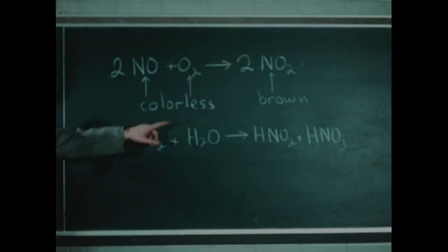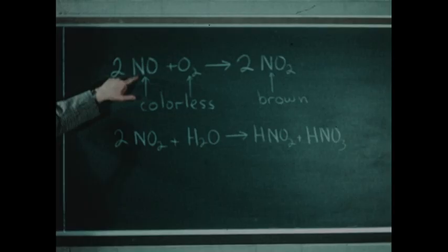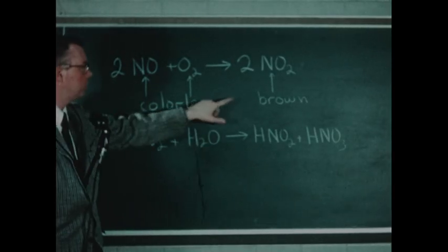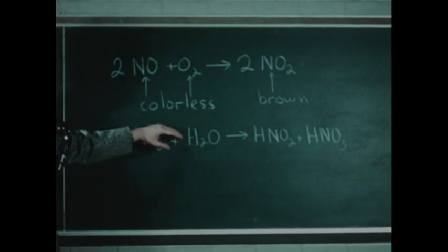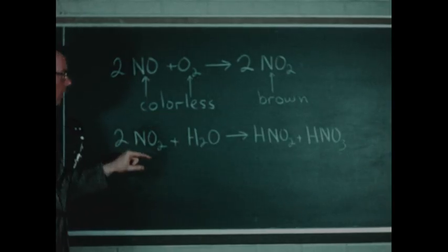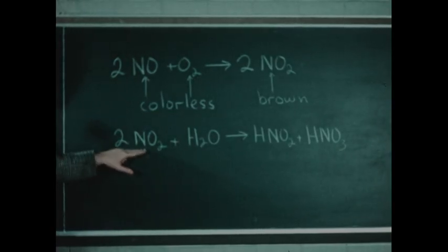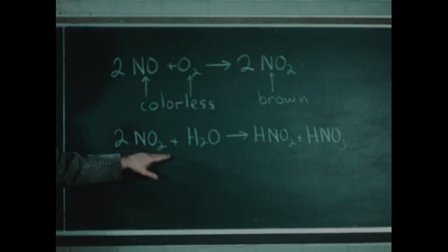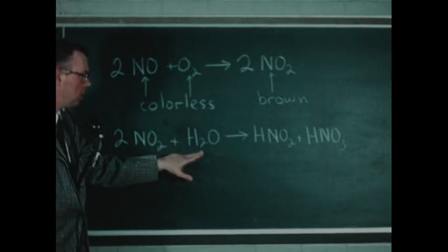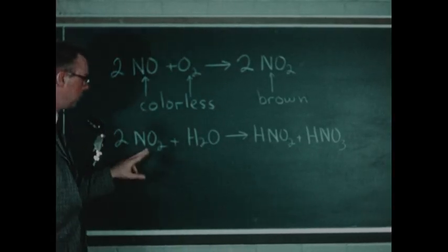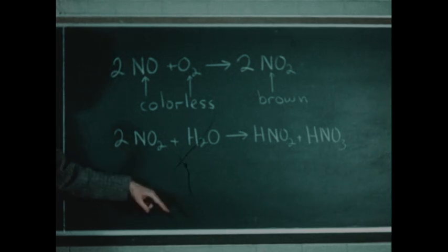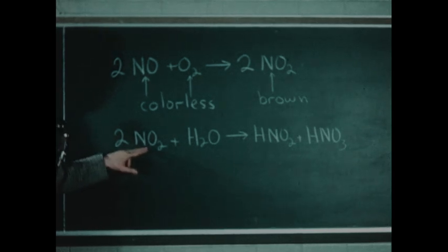When colorless oxygen was added to the colorless nitric oxide in the tube, a rapid reaction took place, producing the brown gas nitrogen dioxide. Then the water rapidly rose in the test tube because nitrogen dioxide dissolves in and reacts with water, as indicated by this equation, yielding a mixture of nitrous and nitric acid. This means that the nitrogen dioxide left the gaseous state, and as it did so, water rose in the tube to replace it.